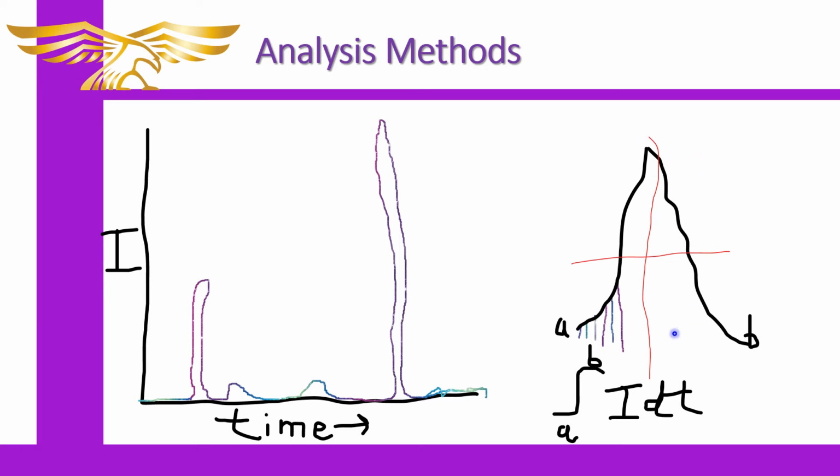On newer instruments, you don't have strip charts that have these curves like this. So that is the advantage, in that they will integrate the area under the curve for you and print it into a table at the bottom, or even on the computer screen, and you can write it down. And it's much more accurate that way, because obviously these can take on different shapes. They may not be a perfect square or a perfect rectangle, which is like a really easy shape to calculate the area of. It's probably something a little bit curvy and has little bitty infinitesimal changes, so you have to integrate that to actually get the area that's really there.